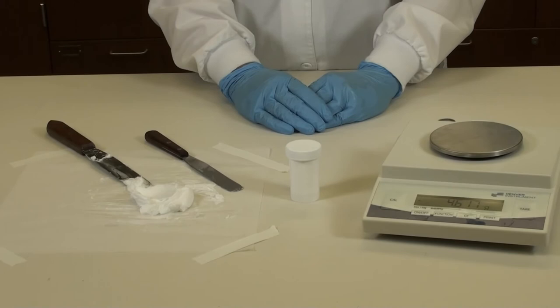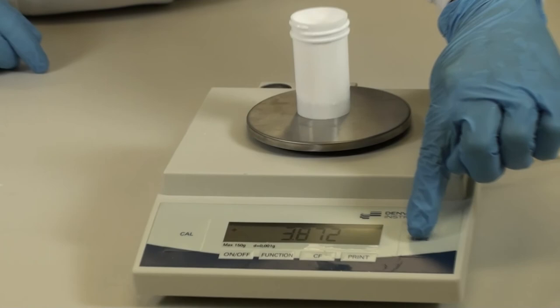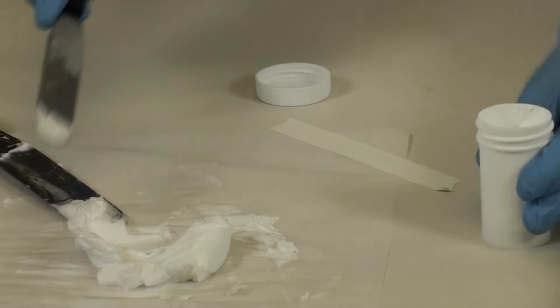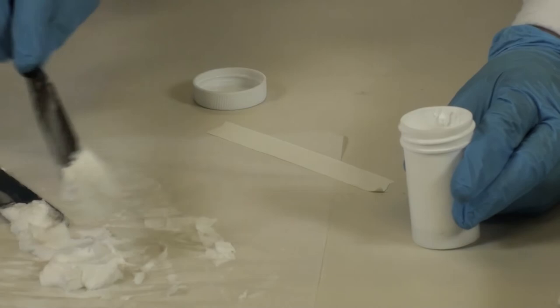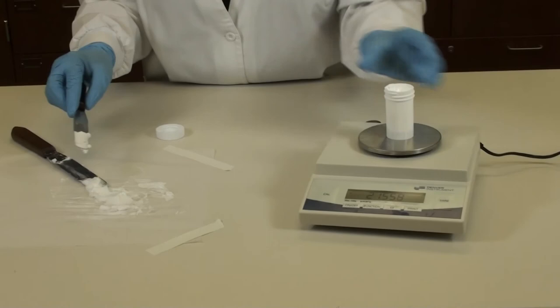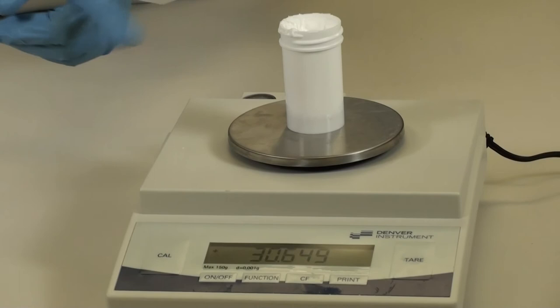We now want to go ahead and place 30 grams of our cream inside our ointment jar. So go ahead and place on your scale the empty ointment jar and tare the scale. Go ahead and start scooping, tapping after each addition, and placing it on the scale to check for the correct weight. Once you're at the correct weight, go ahead and record this weight in your QA documentation.